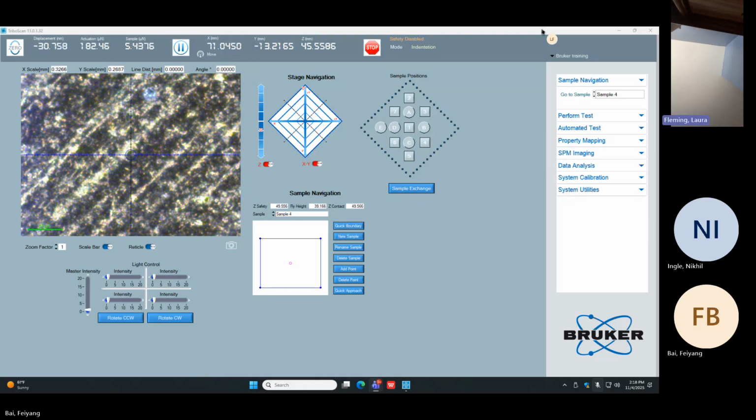So you can see that there are some predefined sample zones up in the upper right-hand corner of the screen. Do you see that? The 27A3, ED1B. Sounds like I'm at an eye doctor's office. Do you see where we're looking, that big diamond up in the right-hand corner, right-hand area? Right-hand corner here. I actually can't see.